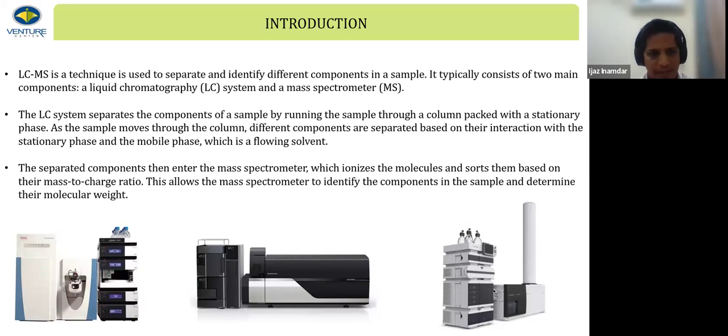But if you talk about HPLC, what it does, it separates the components. So when we are working in an industry, 90 to 99% of the time, we'll work with a complex molecule. The complex mixture is a mixture containing a number of chemical components together.